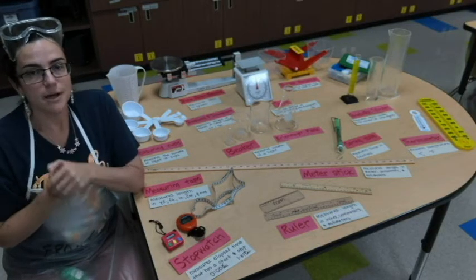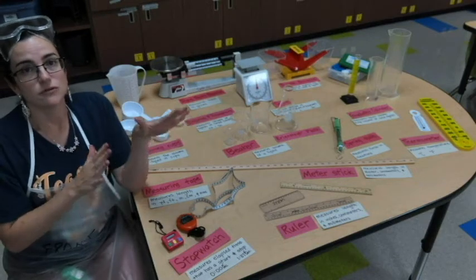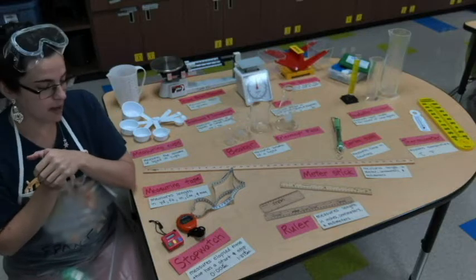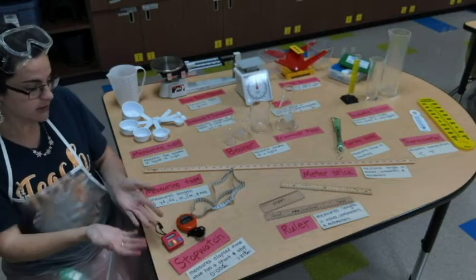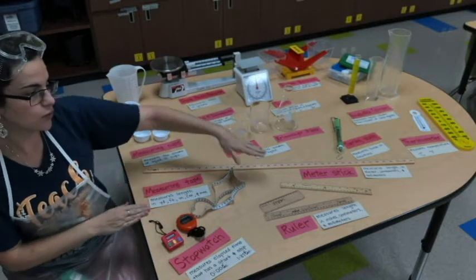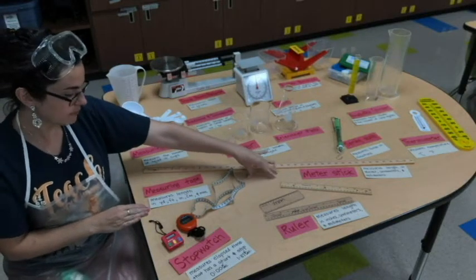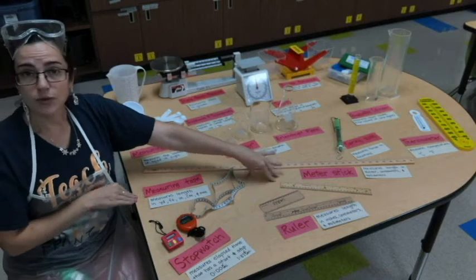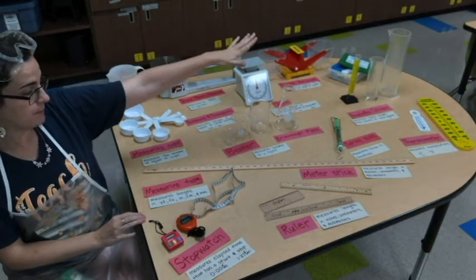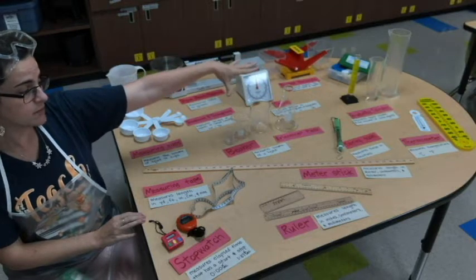There's a bunch of different tools and items that help us with accurate measurements. That might be a stopwatch that measures time. It might be a ruler or a meter stick or a measuring tape to help us measure length.